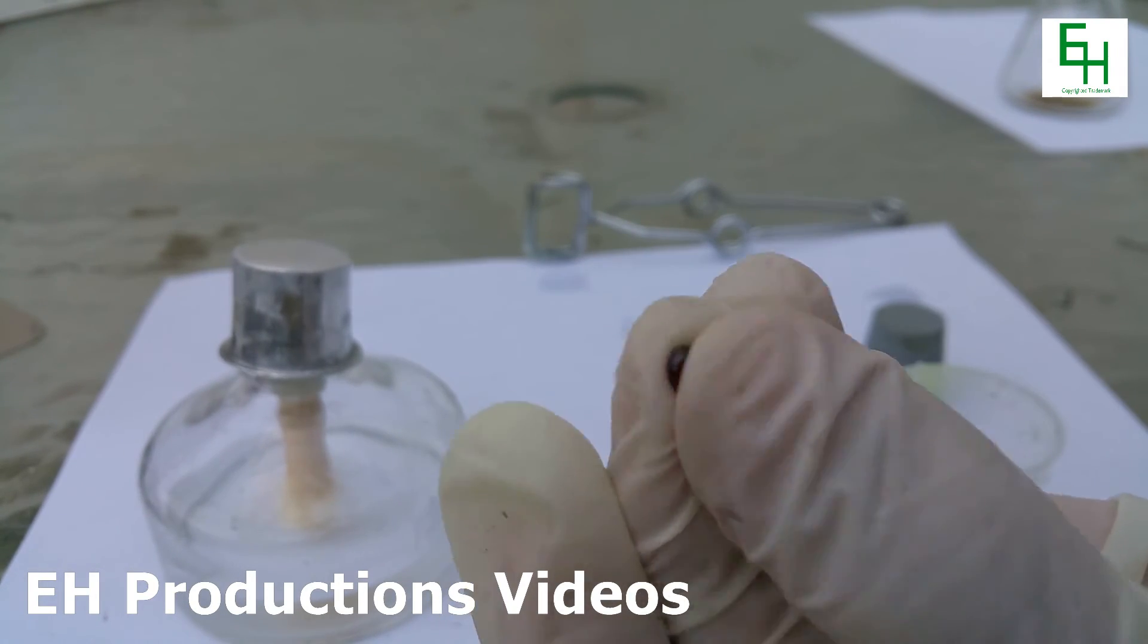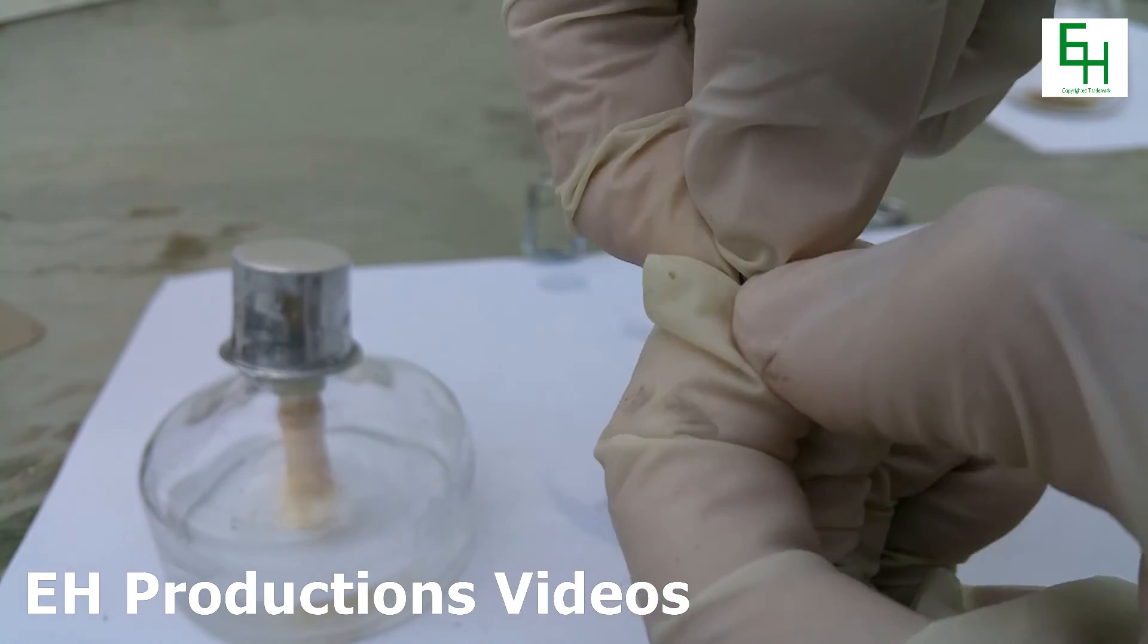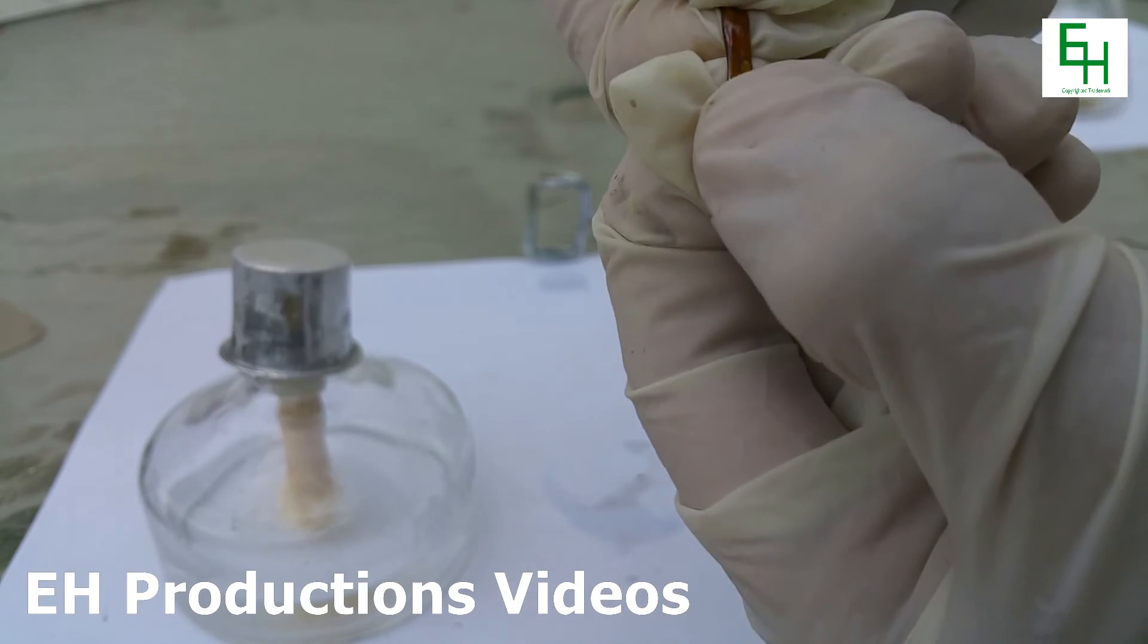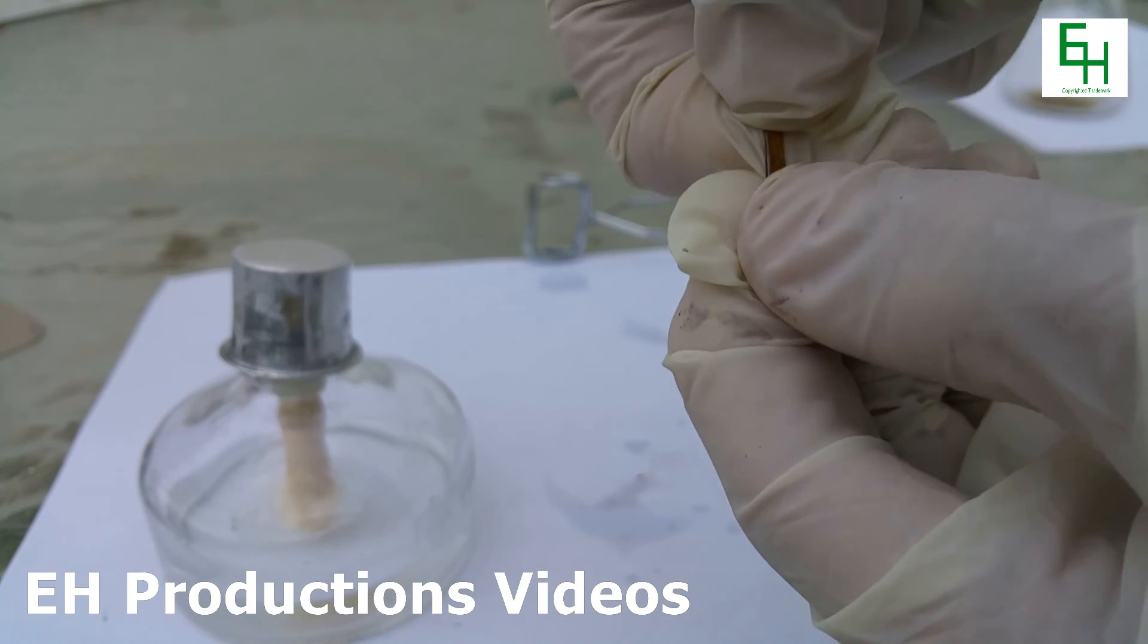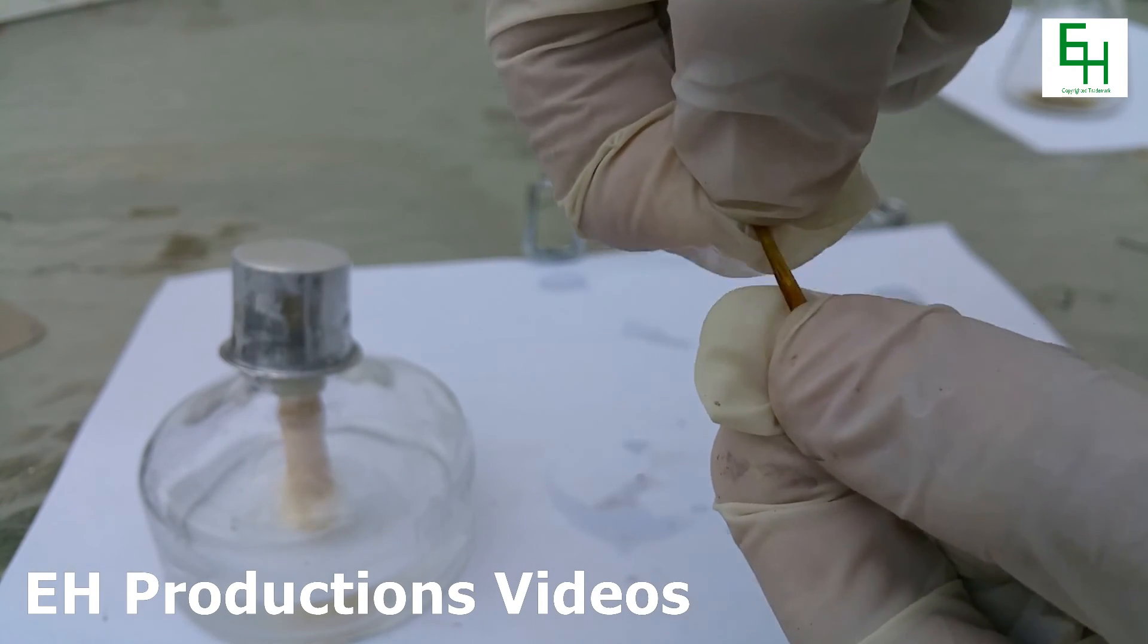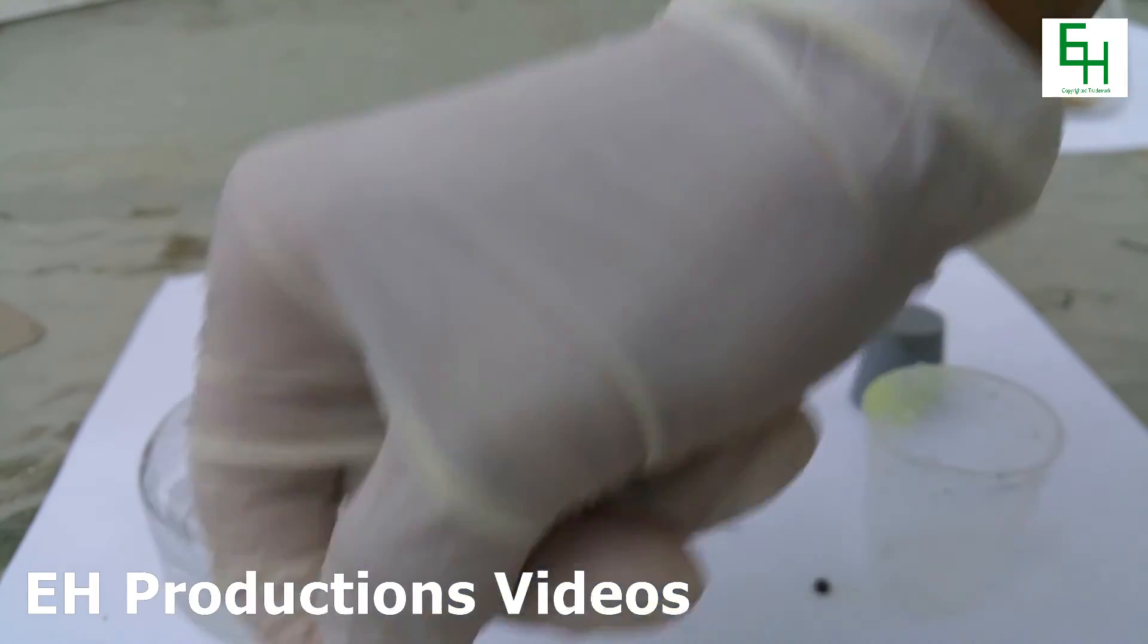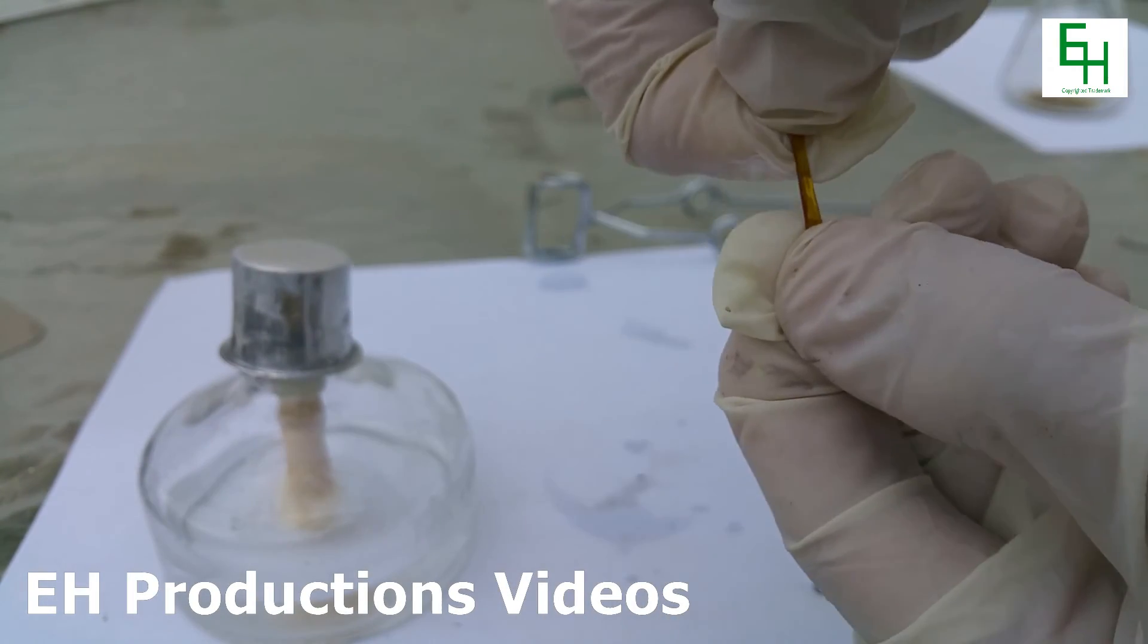As you can see it's a very rubbery, very plastic-like, very stretchy substance. There you go. You can see me stretching it around. It's very different than the powdered sulfur.